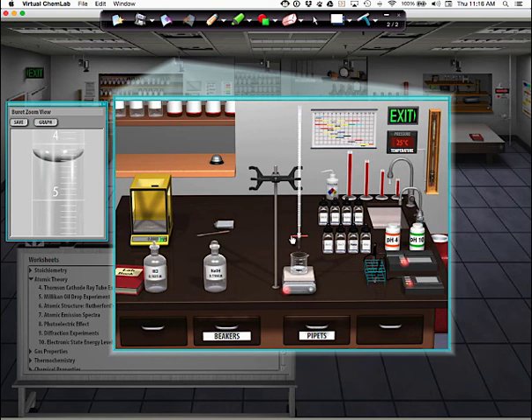Now, in order to add this drop by drop, you can do this. I would say that's a pain in the butt. The other thing you can do is just move this down a little and it adds it slowly drop by drop. But guys, all the while we've been doing that, look what happened over here. This volume has been going down as we're adding base. So now guys, watch both. When we open this up, the volume drops and we can shut it off by double clicking, right?